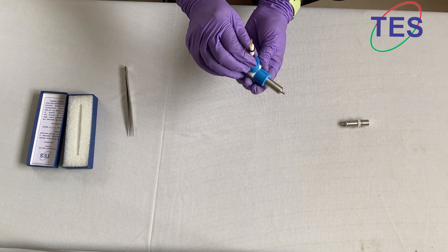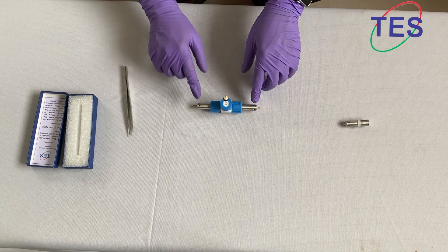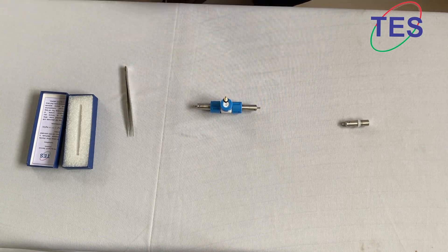This is far enough. You can see this is your working, counter, and reference electrode that's covered.